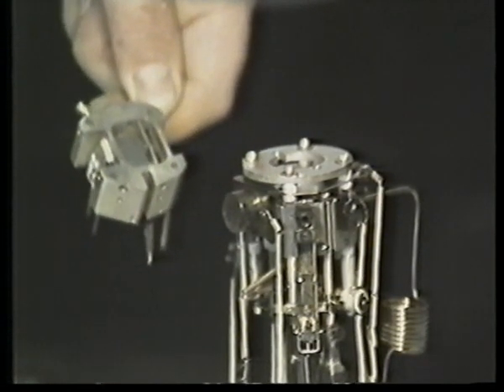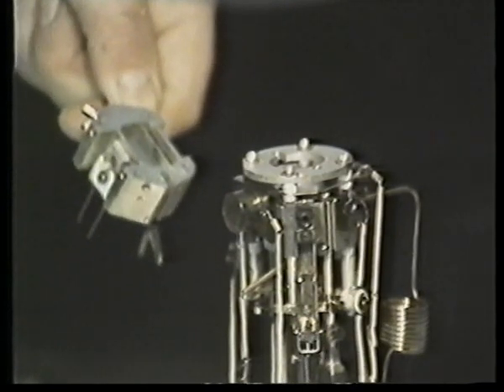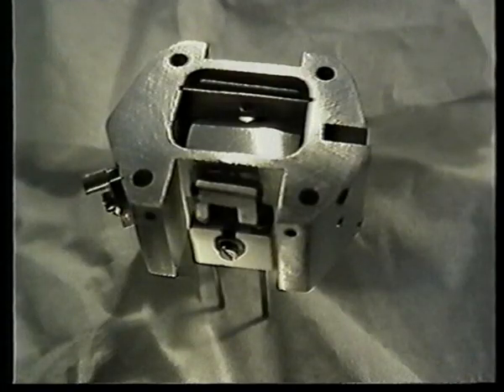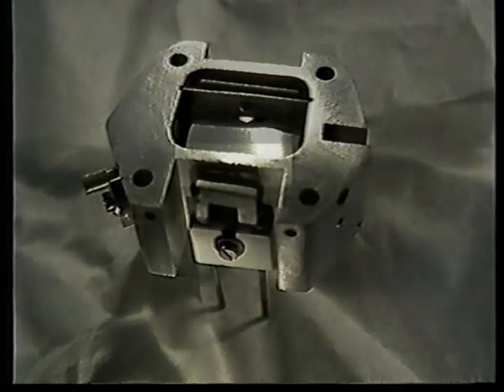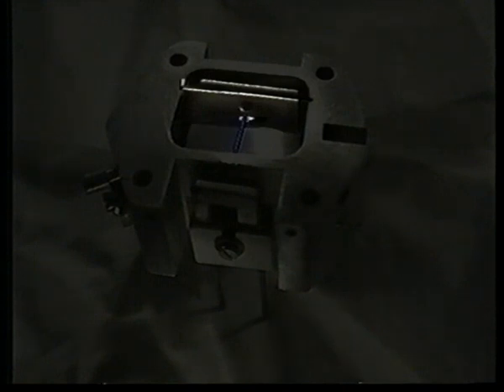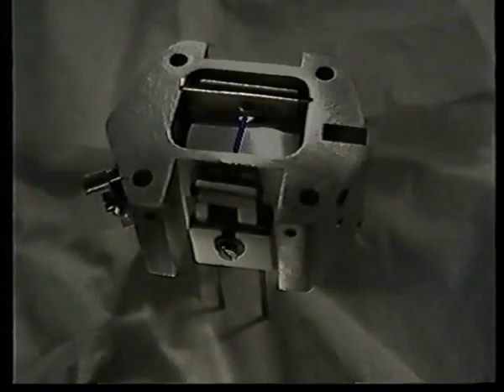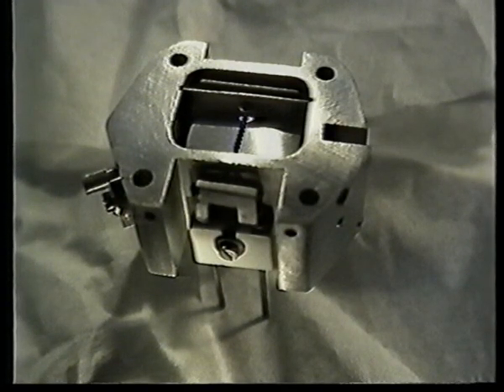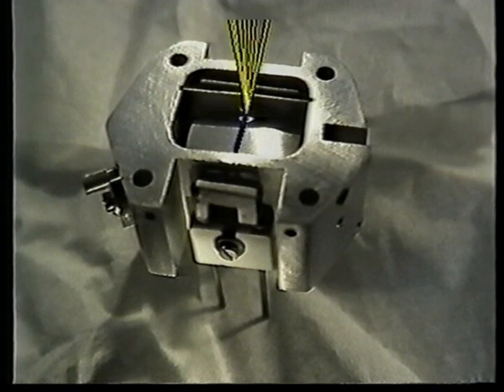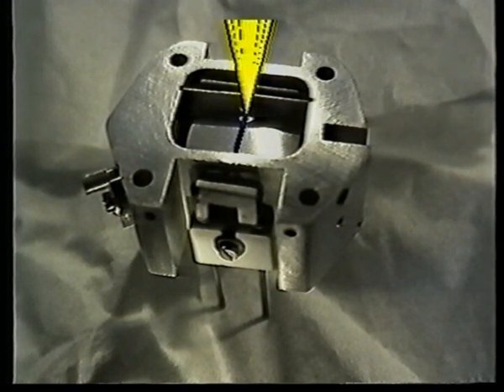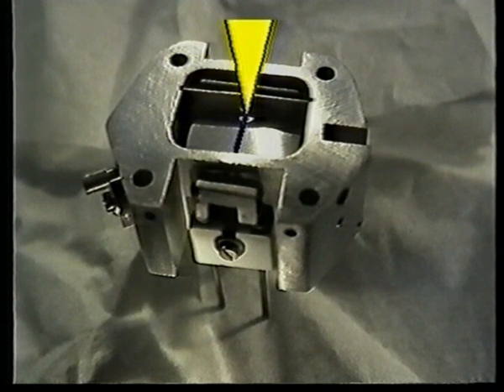Let's now look in detail to see how it works. Electrons emitted by a hot filament located here travel across the iron block by passing through the exit slot to the top positive plate. As they cross, the electrons shown in blue strike molecules of the sample so ionizing them. Positive ions, shown here in yellow, are created. They are repelled at right angles to the direction of the electron flow and attracted towards a negative electrode, or cathode, further along the apparatus.